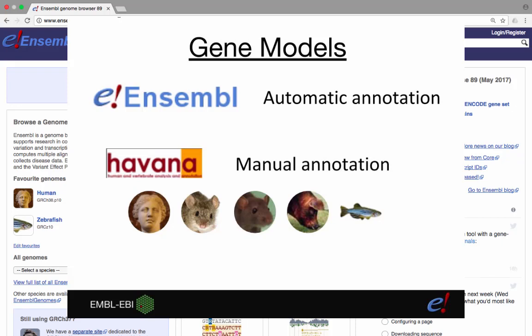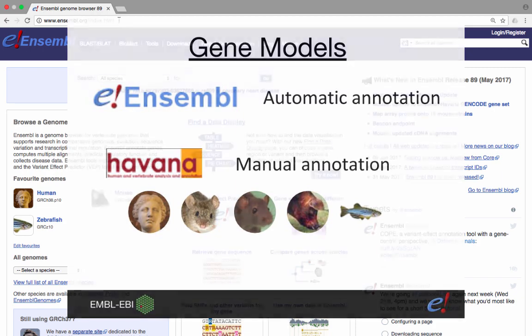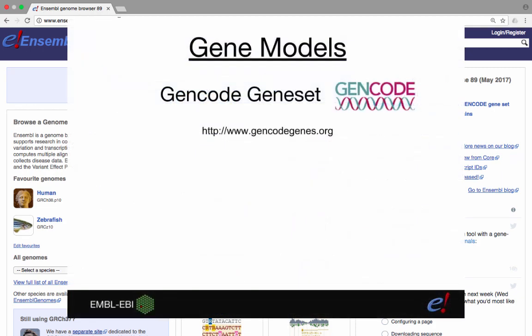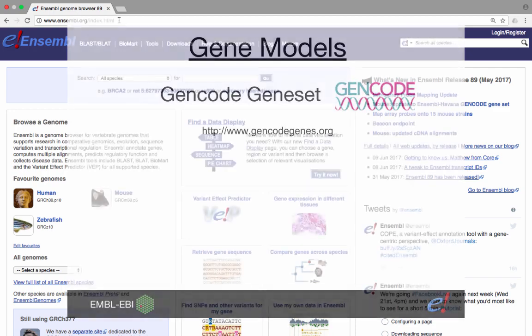For human, mouse, rat, pig and zebrafish, Ensembl also incorporates manually curated transcripts from the Havana project. This merged set of genes from the automated and manual annotation is called the GENCODE gene set.